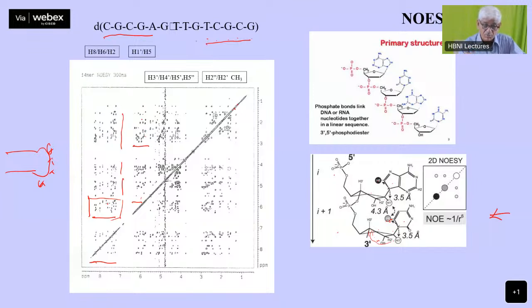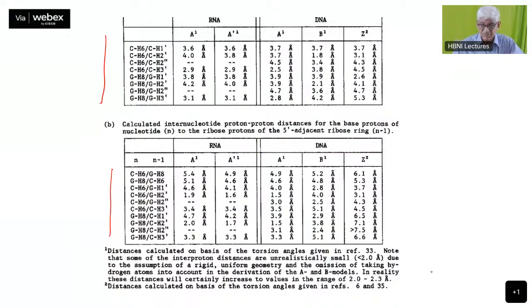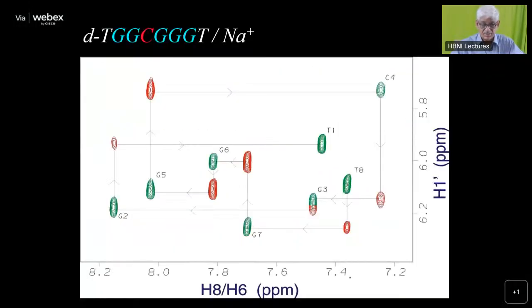And the 2' and 2 double prime, they are showing cross peaks here. The 2' to 2 double prime correlate because there is a short distance. This is only 1.7 angstroms, the 2' to 2 double prime. These are geminal protons. Therefore, you will see the cross peaks here. And that will match with this. If I take any of these two here, the corresponding peaks will indicate these are the 2' and the 2 double prime peaks. Okay, so this is how we obtain the assignments.